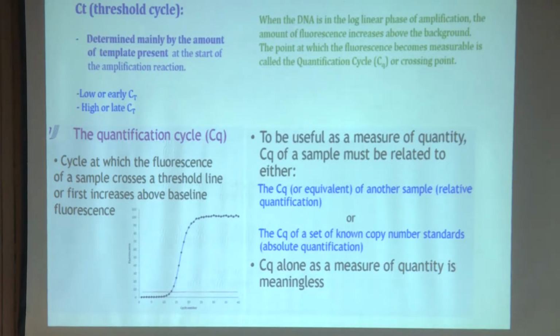We also use the word early CT. And if you have a high CT value or late CT value, that means the fluorescence signal has not come to the threshold level since the templates are not sufficient. The cycle takes a longer time to amplify and get the fluorescence signal, and then they reach the threshold limit, right?